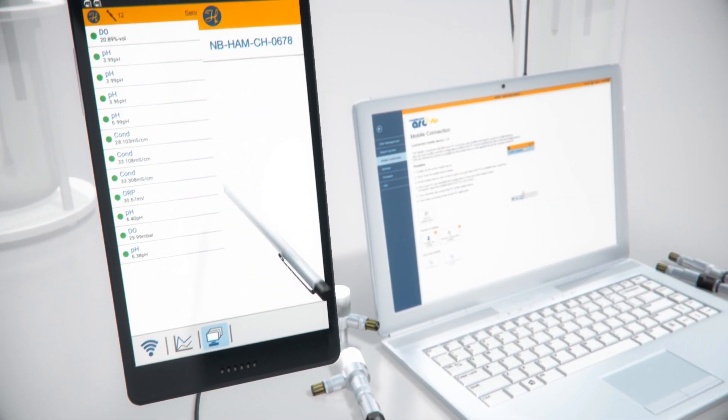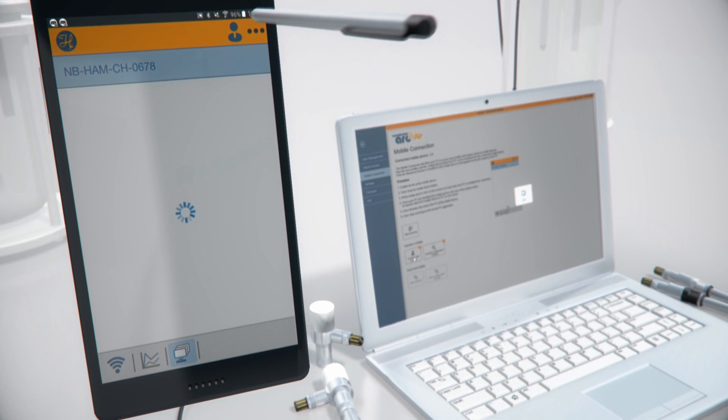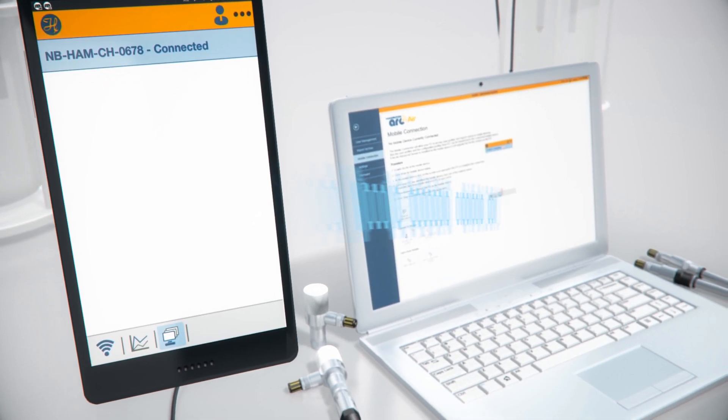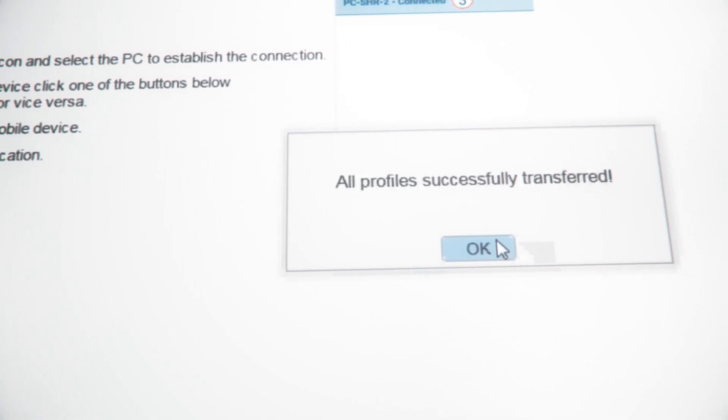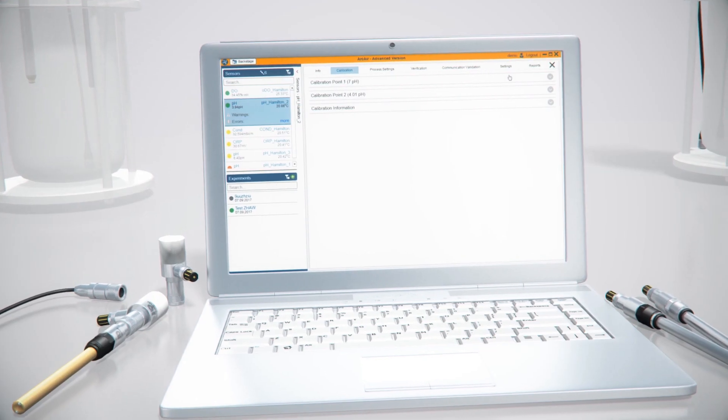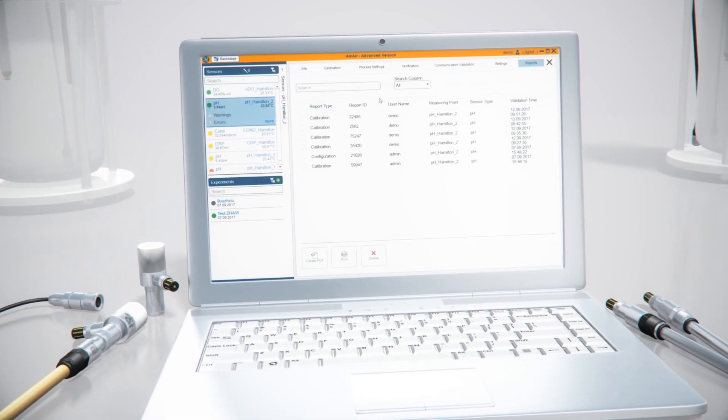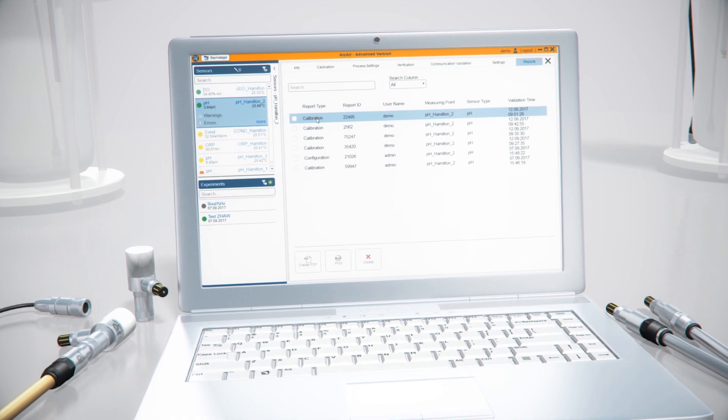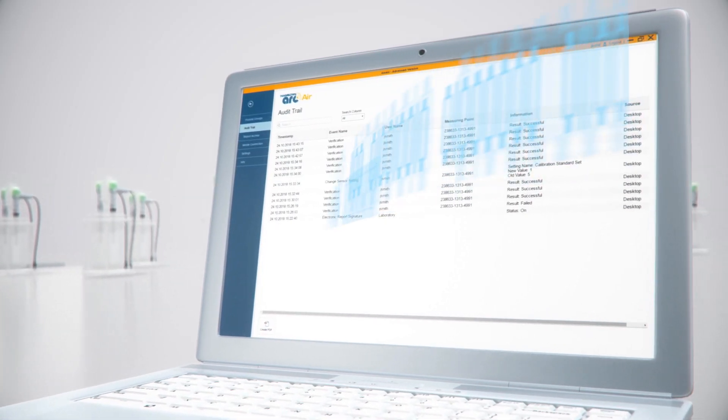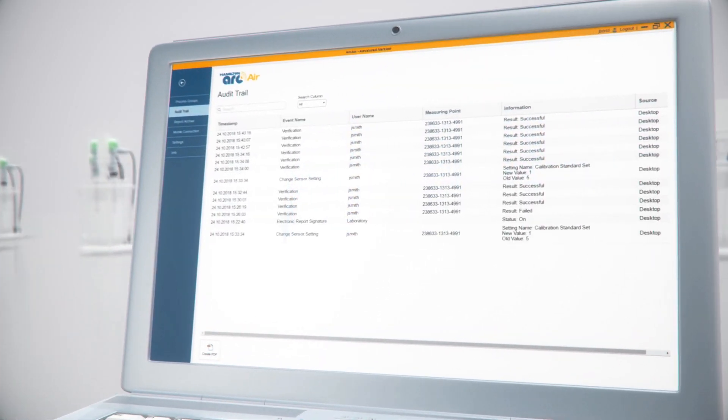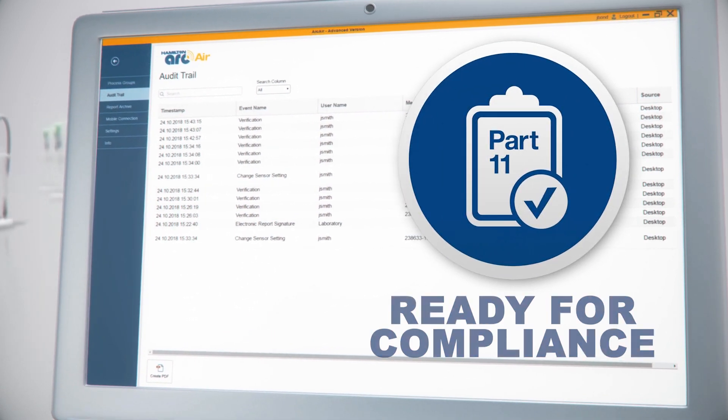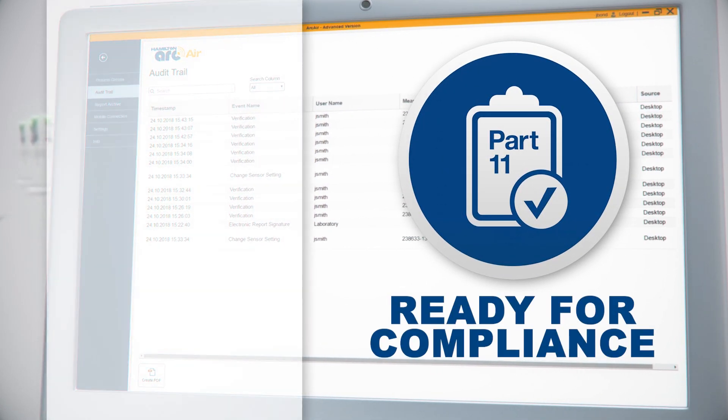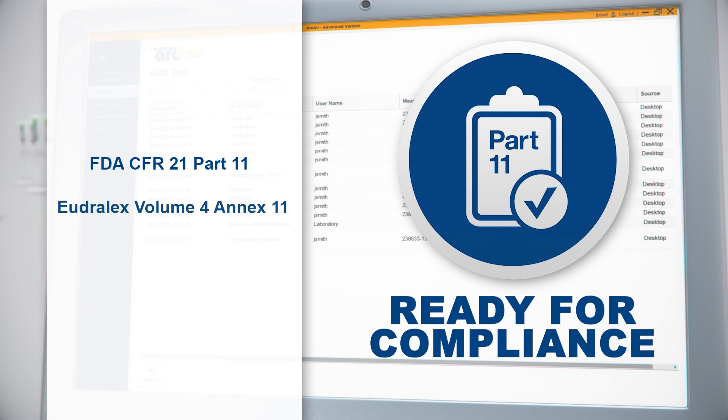After successful calibration, you can save a report automatically together with the creator's electronic signature. Please note that this feature needs to be activated first. You can customize all reports according to your specific needs. ArcAir provides all the features you need to be compliant to GMP guidelines for paperless workflow such as the FDA CFR 21 Part 11 and the Yerdralex Volume 4 Annex 11.